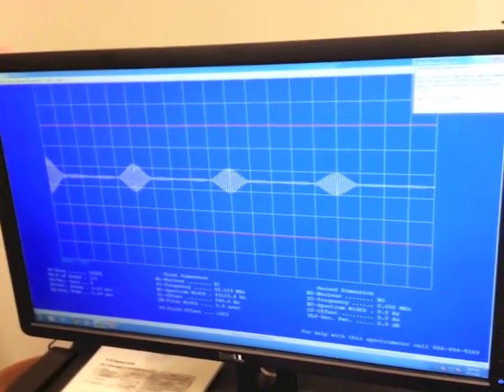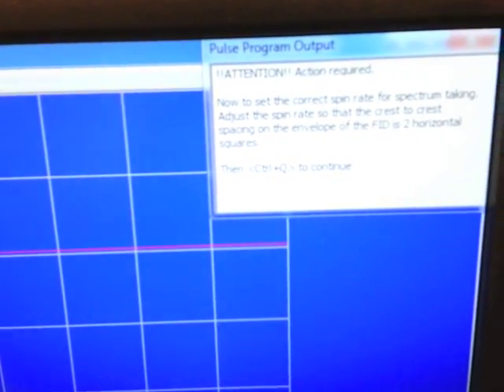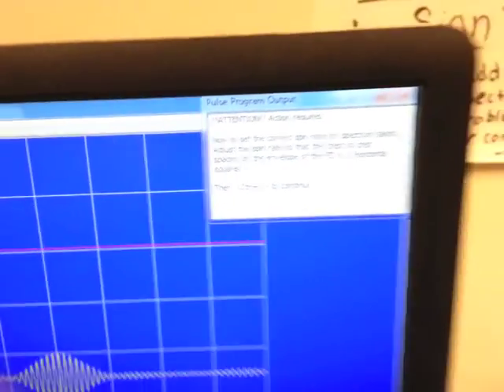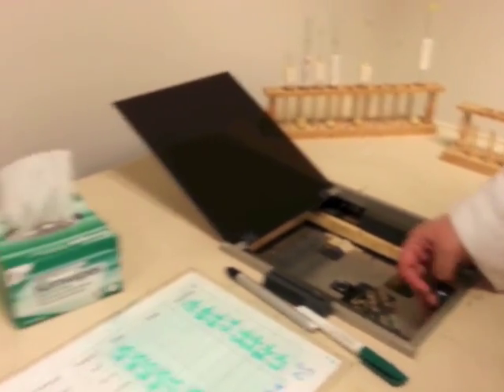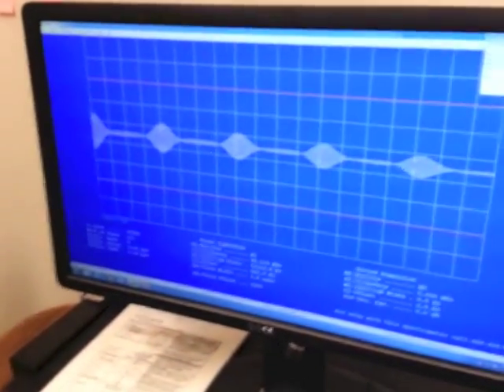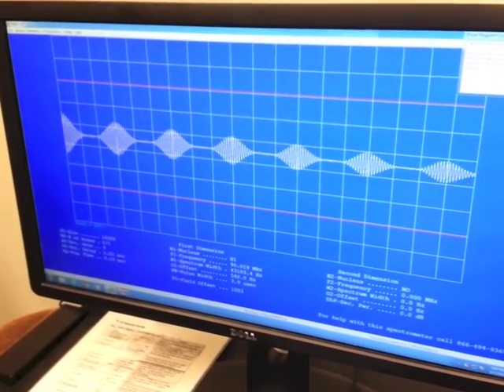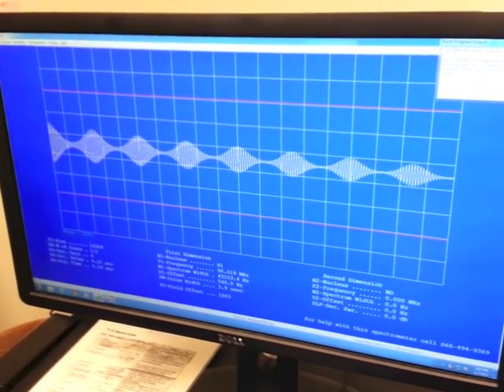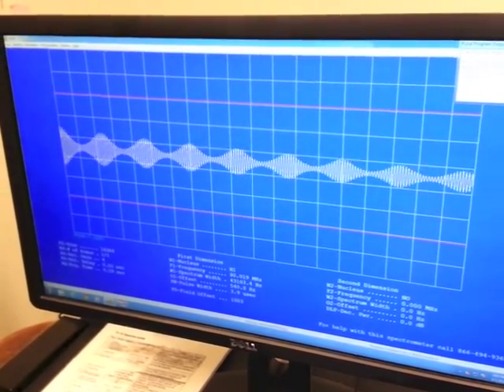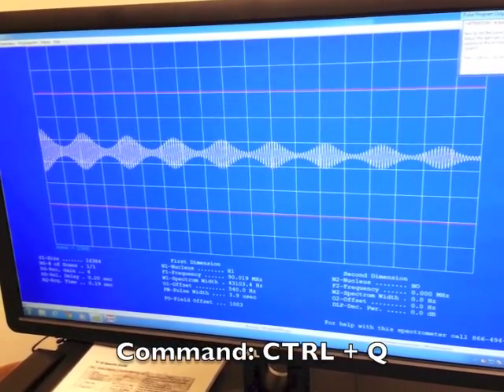After a few minutes, the box will pop up again and it will ask you to adjust the peaks so that there are now two boxes away from each other. Go back over to the knob to adjust. Once the peaks are two boxes away, come back over to the computer and press Ctrl-Q again.